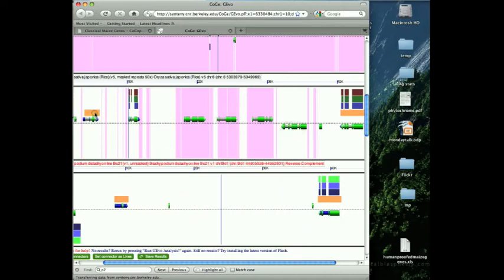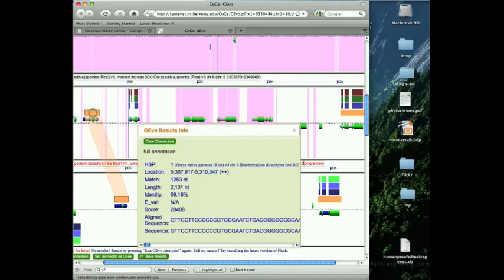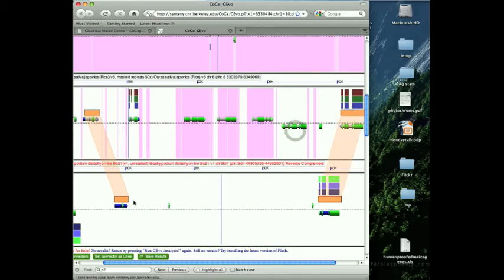But the main thing to note is that we still have these two hits in brachypodium, and these are the sort of hits we use to predict where a syntenic region is, but the C1 gene appears to be completely missing from the sequence, which is something that probably bears further investigation, but not in this video. Anyway, I hope that this has been an interesting introduction to how you can learn more about your favorite gene using syntenic panels of it made available in the classical maize gene spreadsheet, and using our tool GEvo.